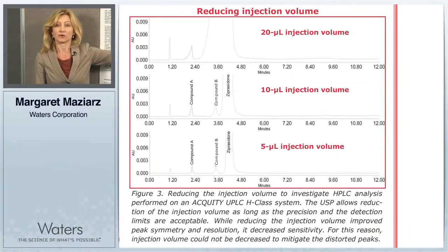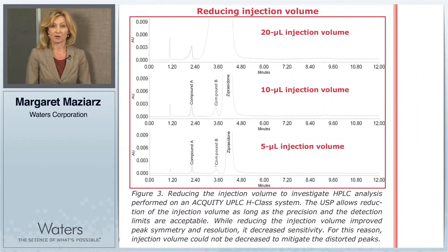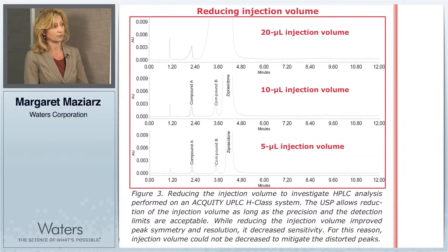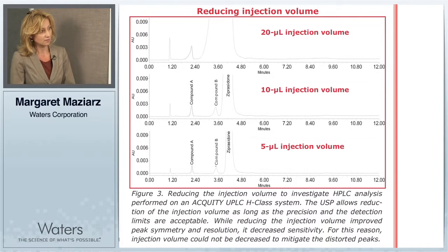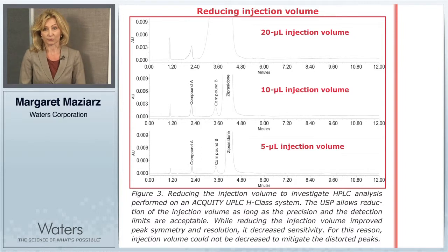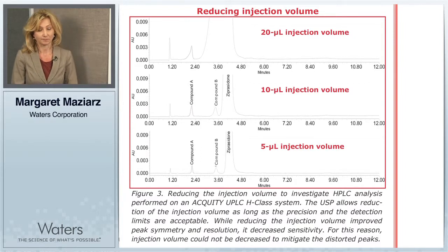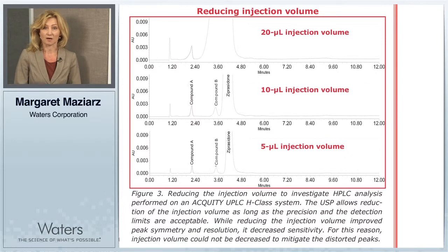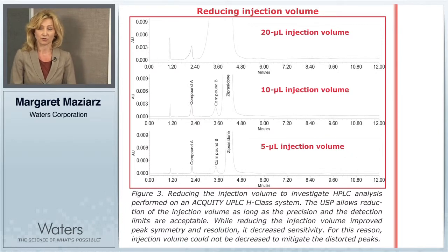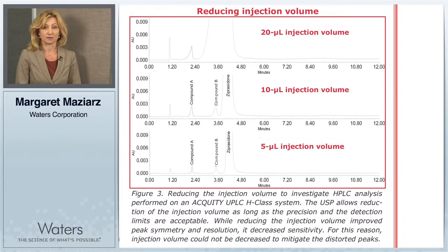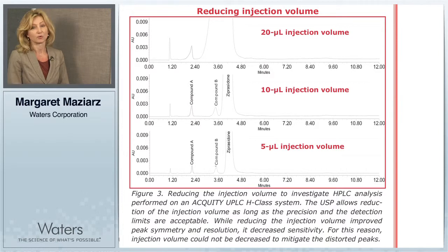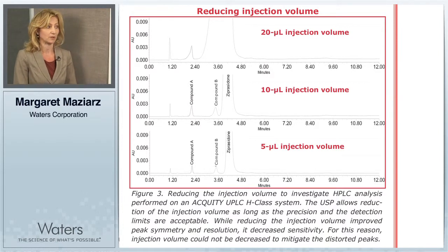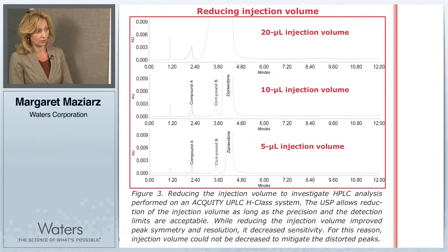As displayed in figure three, we reduced the injection volume from 20 to 10 to 5 microliters. Reducing the volume significantly improved the separation, resolution, and peak symmetry, but it also reduced the sensitivity. USP allows modifications to the injection volume as long as the limit of detection remains acceptable. In this case, however, we couldn't use the reduction of the injection volume to mitigate the peak distortion.